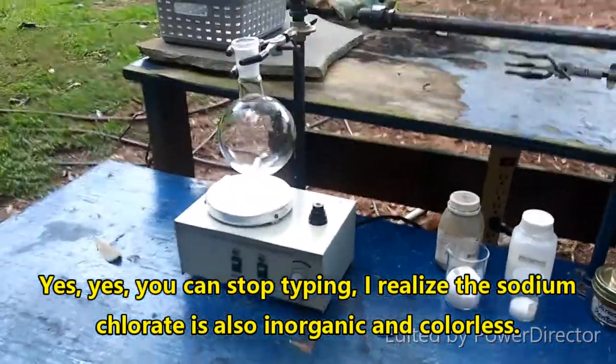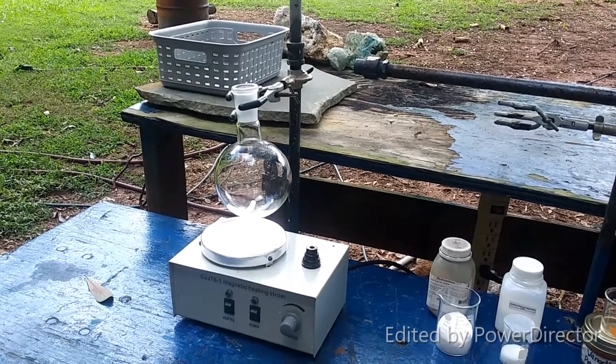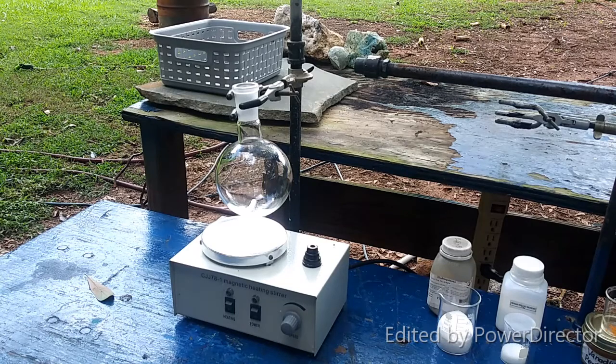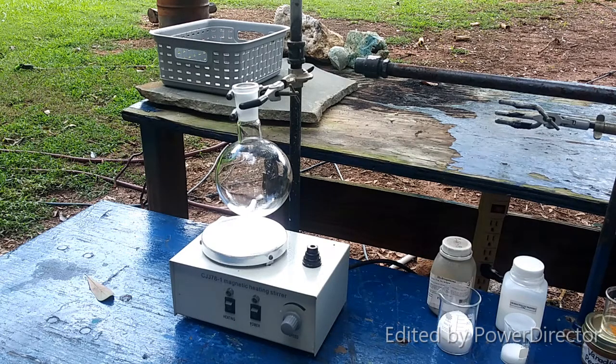What I'm going to do now is combine all of these in this round bottom flask. According to the protocol, you literally just have to combine these things and let it stir for three and a half to four hours to get our product. It doesn't say it has to be done under inert gas or that temperature has to be controlled, though it does say temperature will go up to about 40°C — don't let it exceed that.